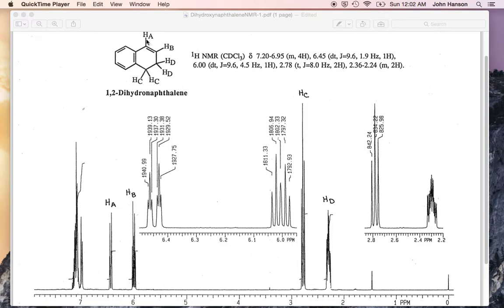Okay, now let's come back to HA and HB, which are kind of a little more complicated than normal splitting patterns like the triplet, but are still pretty analyzable. If we just look at HA, which is right here, and again, here's HA that I showed originally, and now I've blown it up so we can see it, you can really see that this looks like a triplet, and then there's another triplet. So we might see, oh, that's like a doublet of triplets. And let's just see what we think if we look at HA.